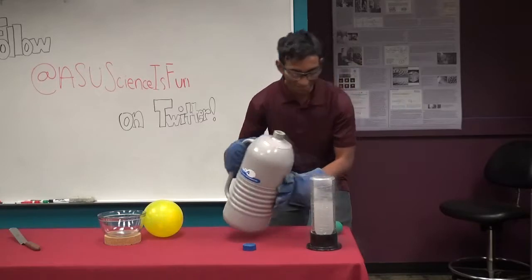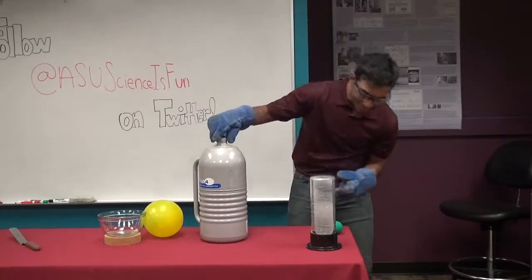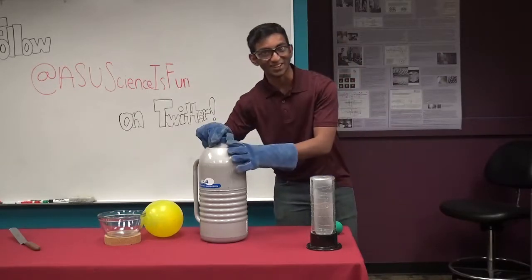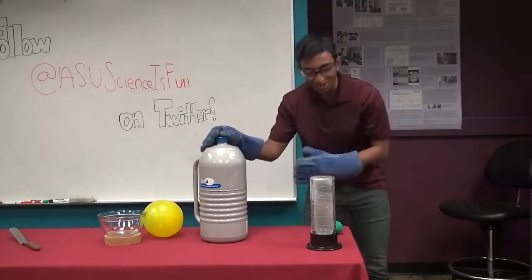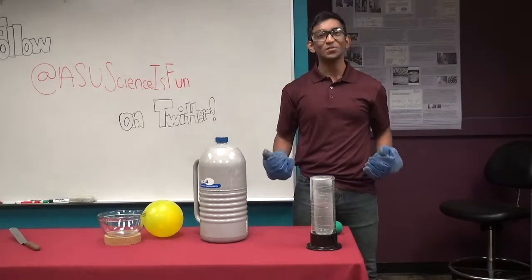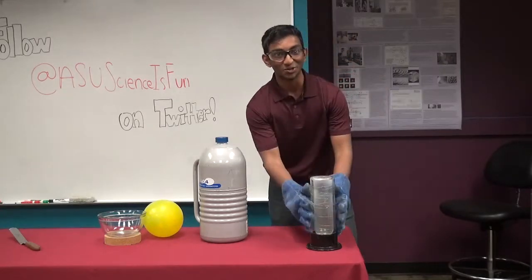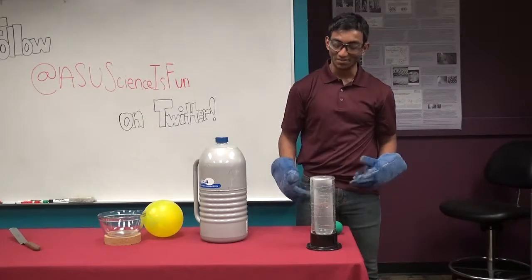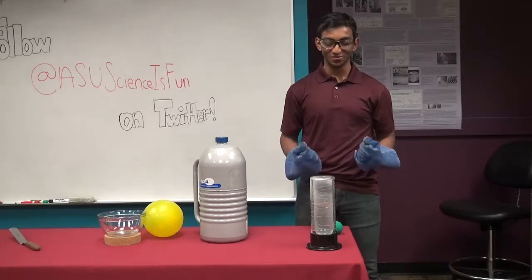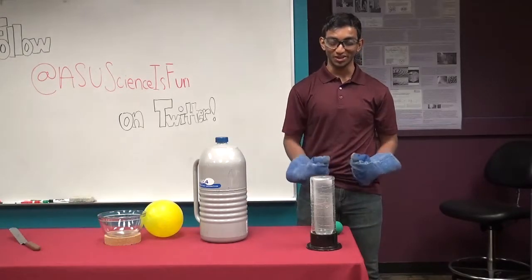What's happening right now? So I said liquid nitrogen is very cold, but it looks like it's bubbling. No, it's boiling. It's boiling right now. So why would liquid nitrogen, if I just said it's very cold, be boiling? Where would it be getting the energy to boil from? You're right, it's getting it from the dewar itself. Because there's a difference in temperature, the dewar is providing it energy to boil. The heat is going from the hot dewar to the cold liquid nitrogen.